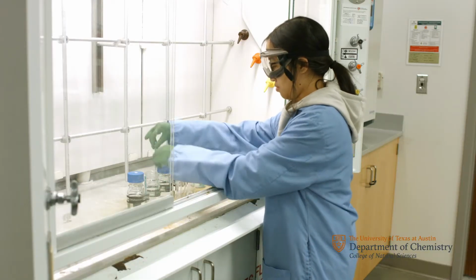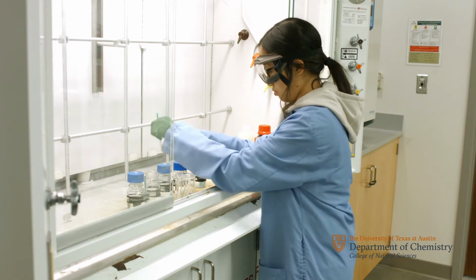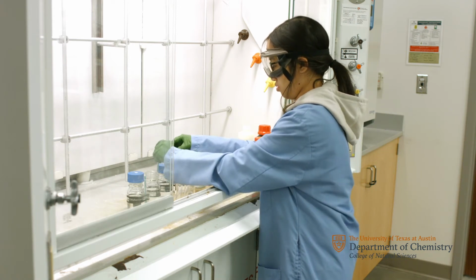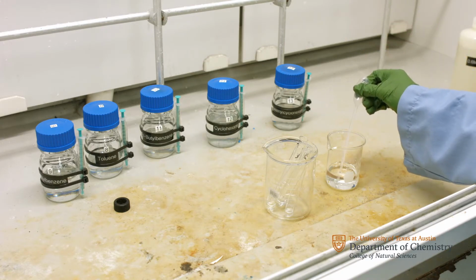Next, using the syringe, carefully draw up 0.5 milliliters of each compound and add it to the corresponding test tube. Now, using a pipette, add 2 milliliters of DCM to each test tube.